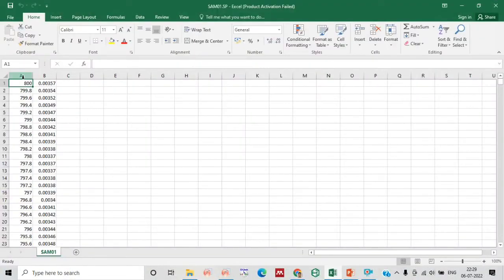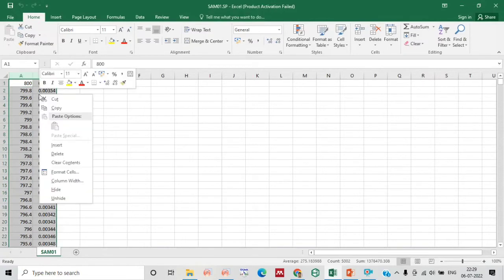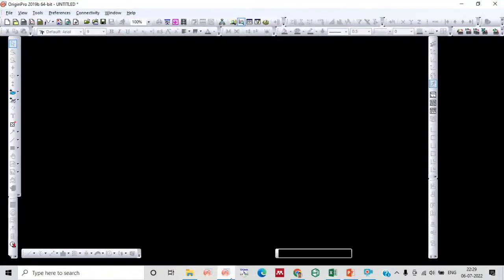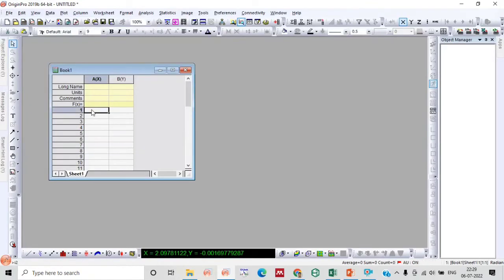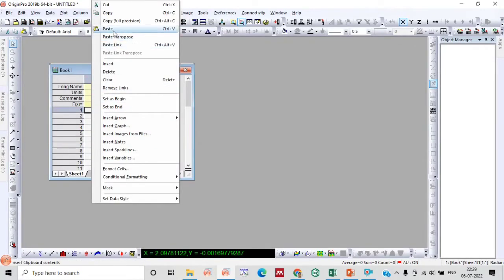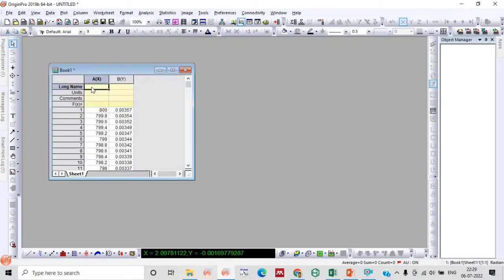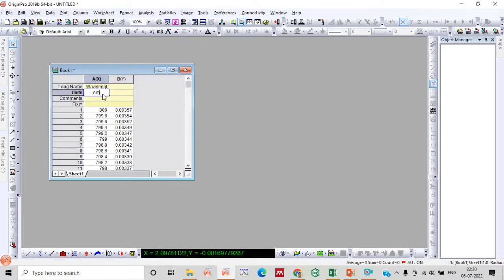This is the UV-Vis absorption plot of an organic molecule. Let's select this molecule and copy it. This is Origin 19 software — we will take one new workbook and paste it here. In the x-axis we will write wavelength whose unit is nanometer, and the y-axis is absorption.